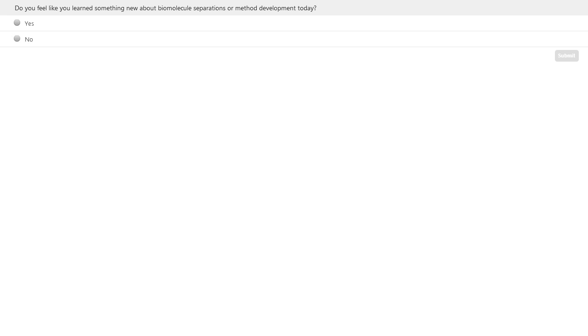If it's got multi-steps, then I'm guessing there will be some small gradient parts in there. It might be quite hard to optimize, I would say, if you're going to work with something like that. And I'm not sure we've done much work with isocratic, to be honest. We've really tried to stick with low percentage increase gradient methods.